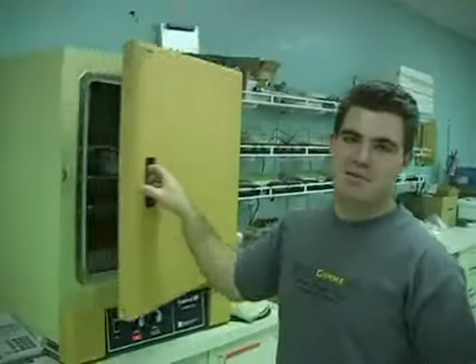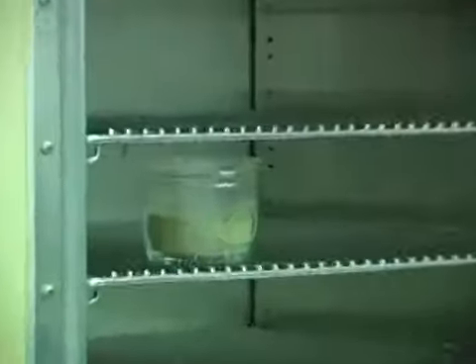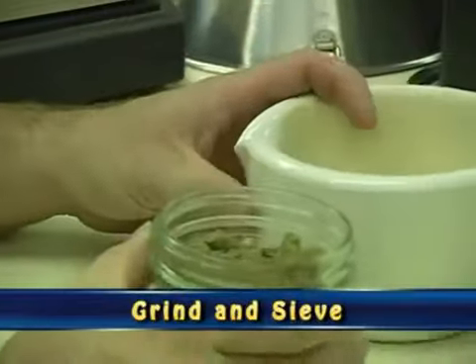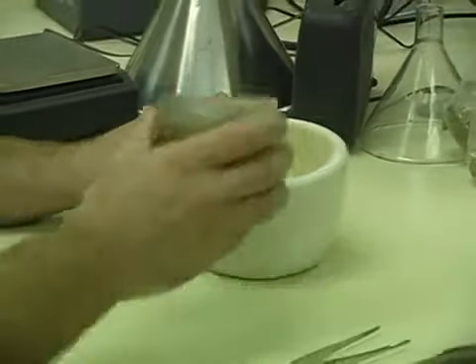overnight. Now that the samples have stayed in here overnight, you're just going to turn the oven off and let them cool. And then after that, you're going to be able to take them out and begin the sieving process. Grind them all up and sieve them to get all the particles that are under 2 millimeters.